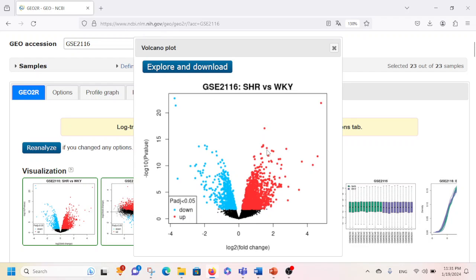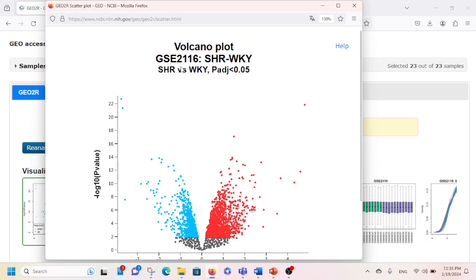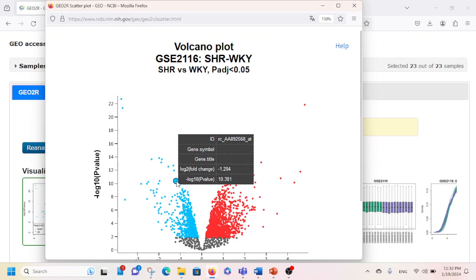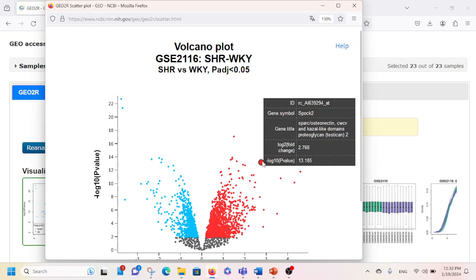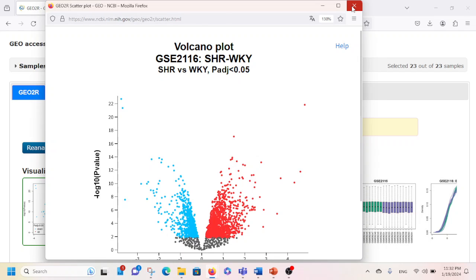If you want to explore further and look at each of these dots, you can click on Explore and Download. When you do that, a window will pop up and if you click on a dot it will show which gene is represented. For example, clicking one dot shows the gene is SPOCK2, clicking another shows it is ANLN, and so on. Then I'm going to close this window.